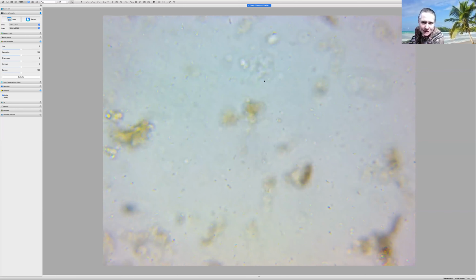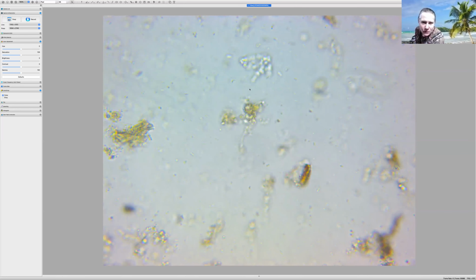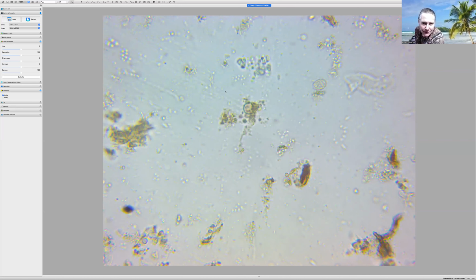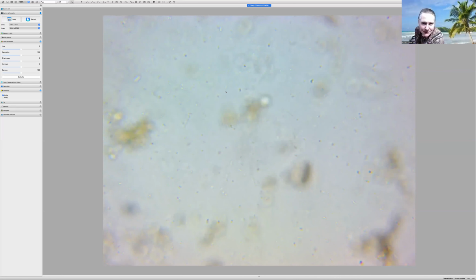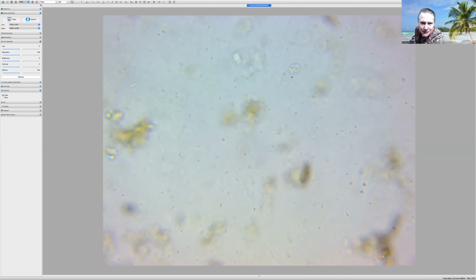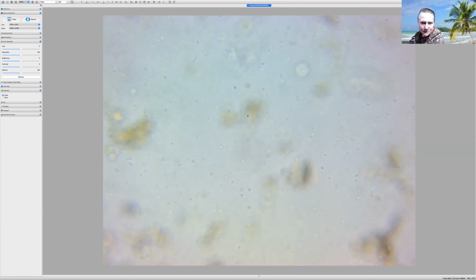Let's see if we can get him. He came in focus a little bit. I wanted to try to catch his tail, which I am not catching. Okay, let's see if we can catch his tail. He's working around this aggregate here. And he's just not moving quite there. Right there is his tail, and he is using it to grab onto things.